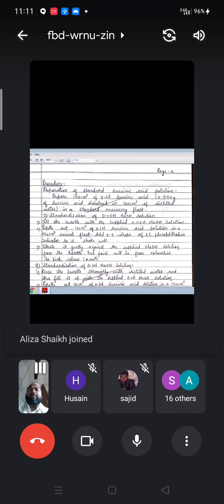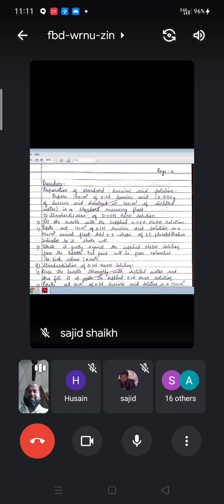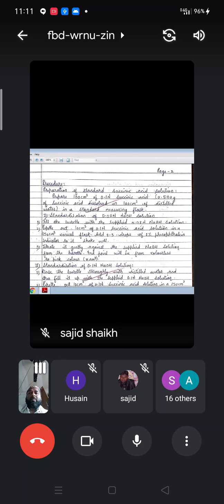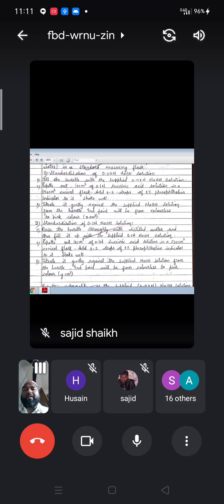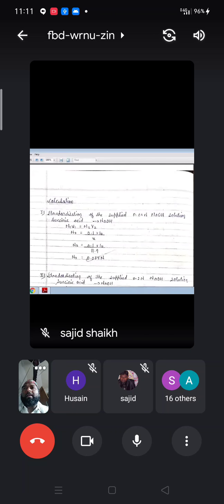Then we standardize the NaOH solutions. First we standardize one solution, then the other. Fill the burette with the supplied NaOH solution, which may be of different concentrations: 0.08, 0.1, or 0.05 normal. Pipette out 10 cm³ of 0.1 normal succinic acid solution into the conical flask and add phenolphthalein indicator. Shake it, then titrate against the supplied NaOH solution from the burette. The endpoint will be a color change from colorless to pink.